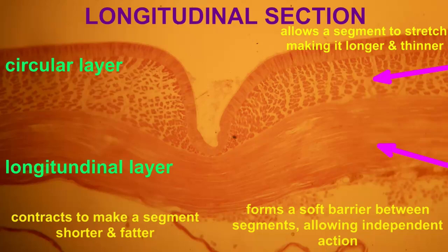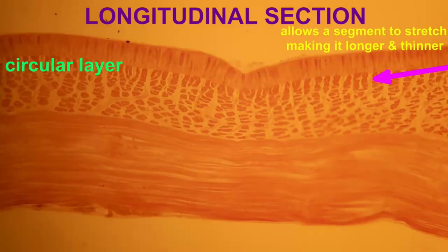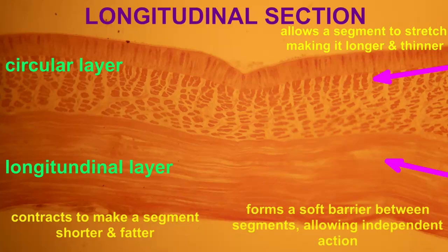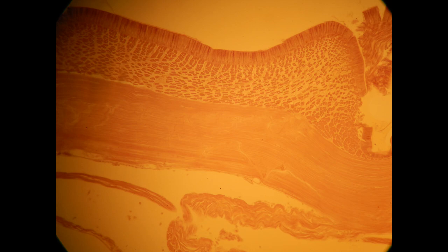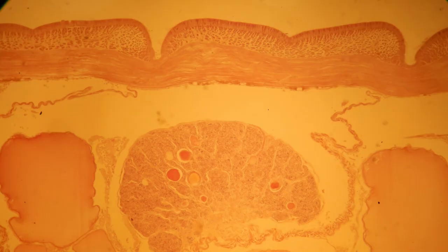In these first images of longitudinal sections — which run the length of the earthworm's body creating left and right halves — one can see the circular muscles in cross-section as they go around each segment, while the longitudinal muscles underneath can be seen going along the length of a segment.